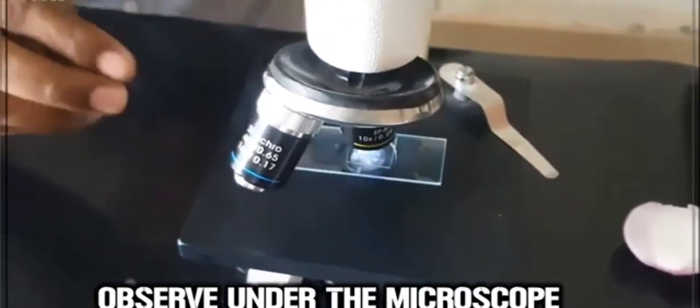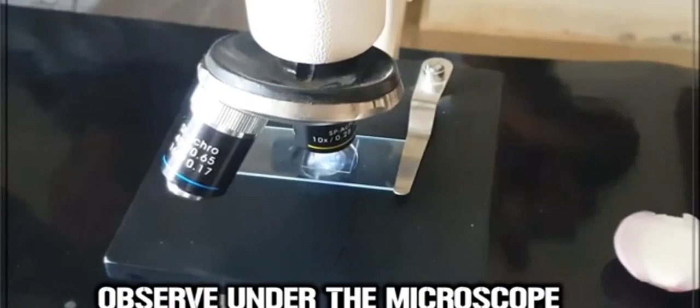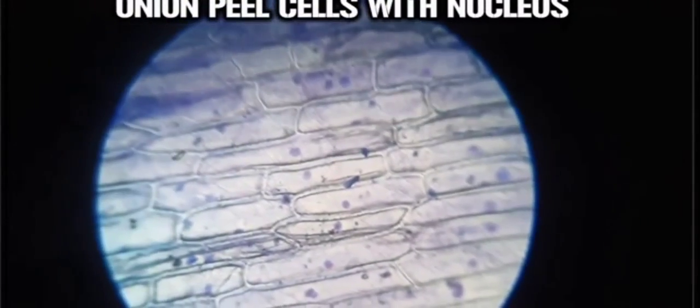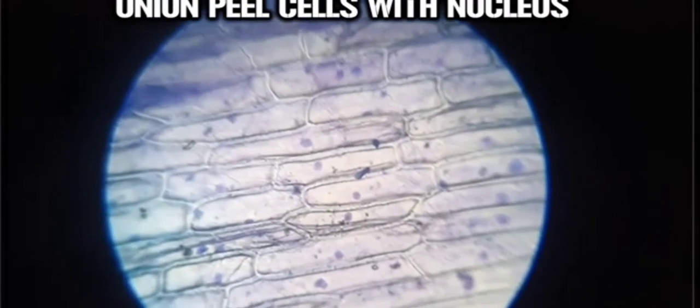Then when you are placing it under the microscope, clamp it with the clip, adjust the microscope and observe it. When we view it through the eyepiece, you can clearly see, adjustments have to be made. Then the slide will appear in this way, light bluish or violet in color, with the dots which are nothing but the nucleus. So very clearly we can see the onion peel cells with nucleus exactly in this way.